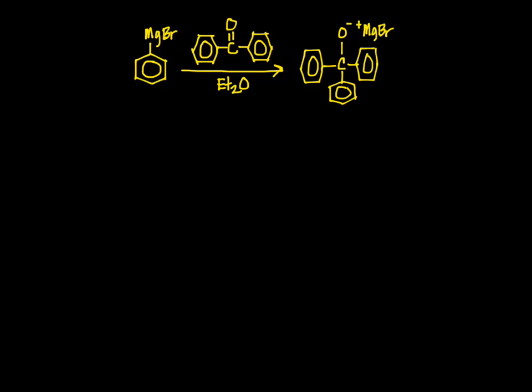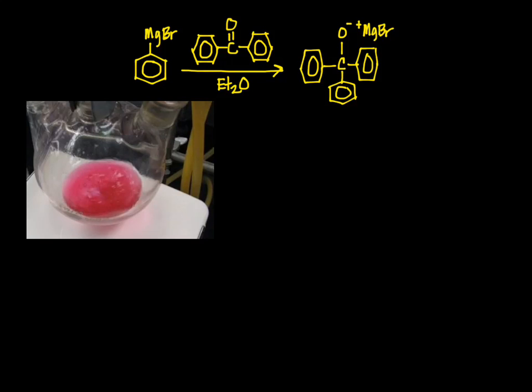The next stage of the reaction is the addition of the ketone. A solution of benzophenone in anhydrous ether is placed in the addition funnel and added slowly dropwise. Almost immediately, the reaction should turn bright pink. This is evidence of the formation of the triphenyl methoxy anion. This step is also exothermic, and if you feel the flask, there should be evidence that it has warmed up. You can add the benzophenone solution at a rate that maintains a steady reflux.